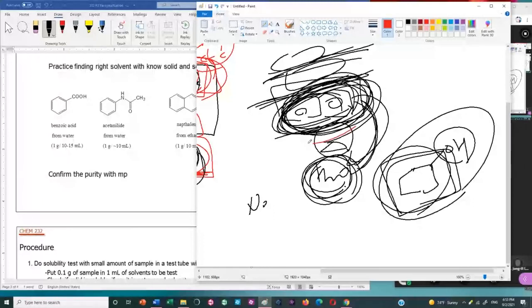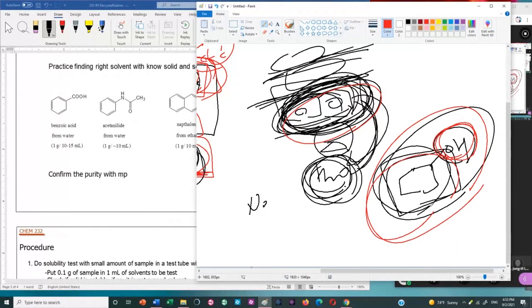The naphthalene's nonpolarity will like this molecule very much because only two atoms are polar, the rest are nonpolar. Here you have 6 carbons and 11 hydrogens, so 17 nonpolar atoms. This is a lot of nonpolarity, so this will easily dissolve in this cyclohexanol solvent.